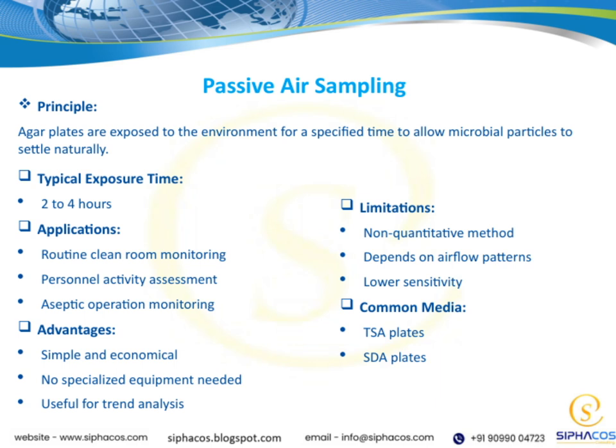You don't need specialized equipment, just agar plates and a way to expose them. Plus, it's useful for trend analysis over time, helping us track changes and identify potential issues in the environment. Overall, while it has some limitations, this method is a practical tool for many routine monitoring activities, especially when resources are limited or quick results are needed.